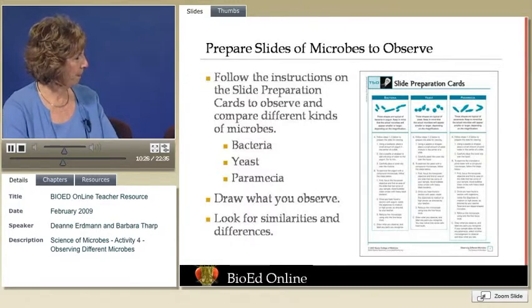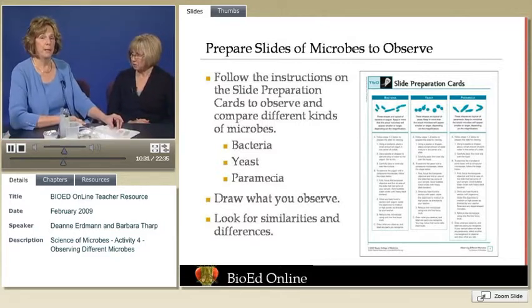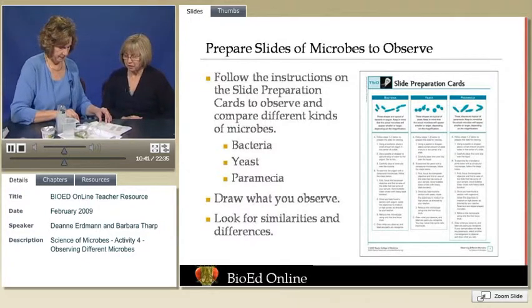And so they're one of the 3 basic shapes of bacteria, which are the rod-shaped, right? Yes, they are. And what are the other shapes? The other shapes are sphere-shaped and spiral-shaped. Wow, that's cool. So we have the 3 basic types of bacteria, and they're all considered microbes. All right, so that's our first slide that we've created and explained.